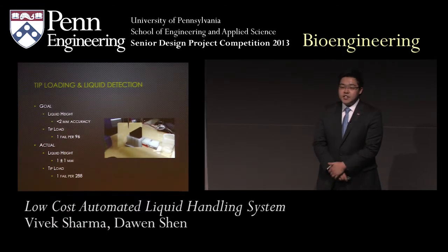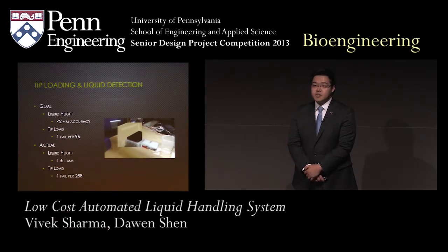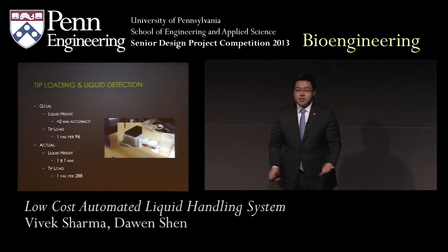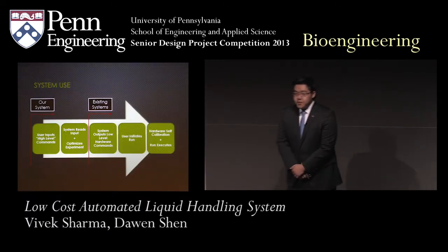The loading and ejection of tips is important to prevent cross-contamination. Whenever you're working with two different liquids, you ideally want to switch tips in between to avoid the issue of contamination. So that's some of the hardware of our system.